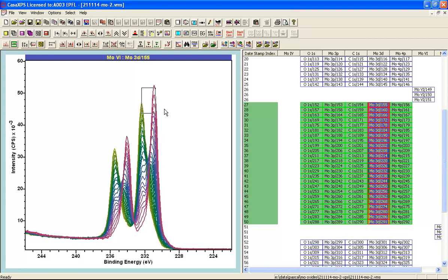Now in the case of the first two measurements, both have metallic character with a small amount of oxide. So the overall influence on the sample is that of a metallic type material. So even though electrons were being returned to the sample by the charge compensation, they were easily distributed and moved to ground if necessary to keep steady potential on the surface. In the case of the molybdenum trioxide, we have a material that has a significant band gap. It's about 3 eV initially.